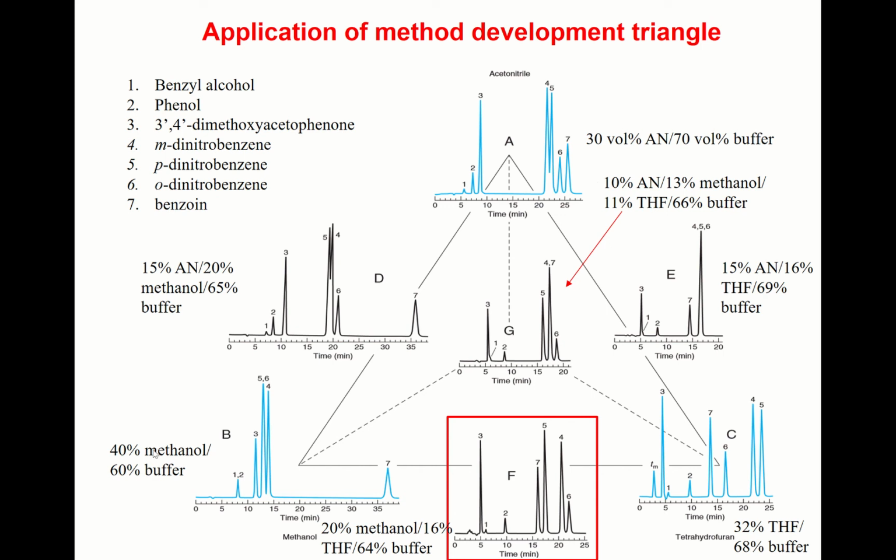Methanol also becomes half, so 20%. But the buffer's volume percent doesn't change much. So let's try these two organic solvents and aqueous buffer mixture as a solvent.